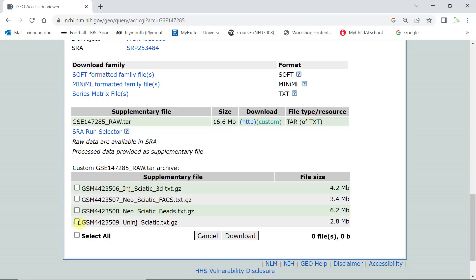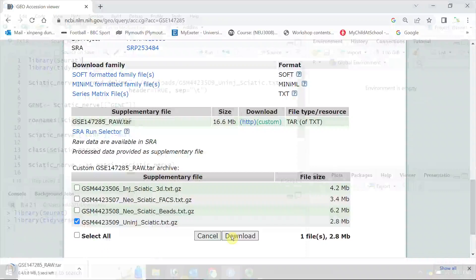We can select this one as uninjured sciatic nerve. We can download it.